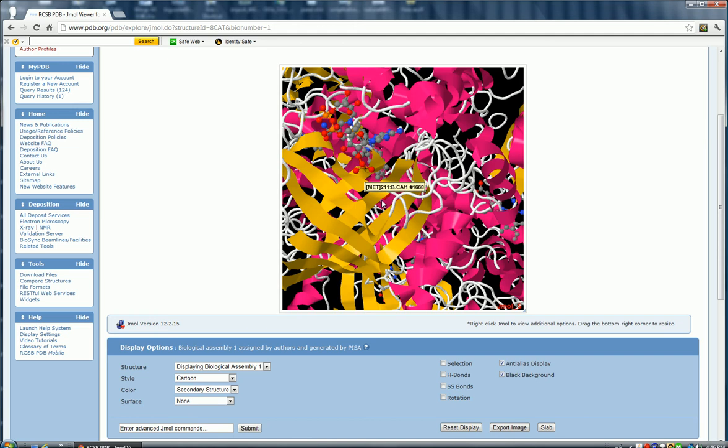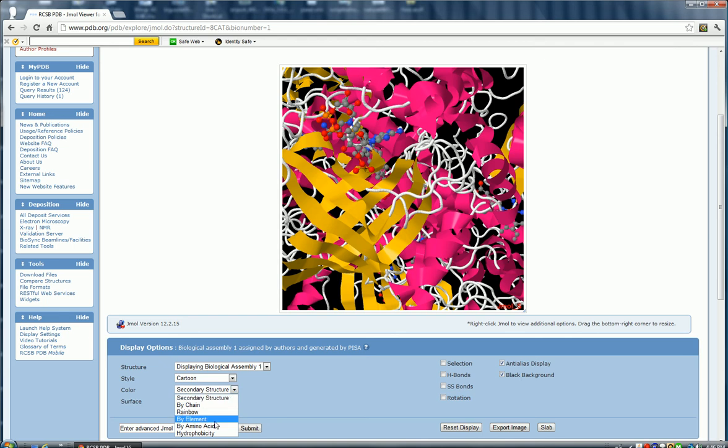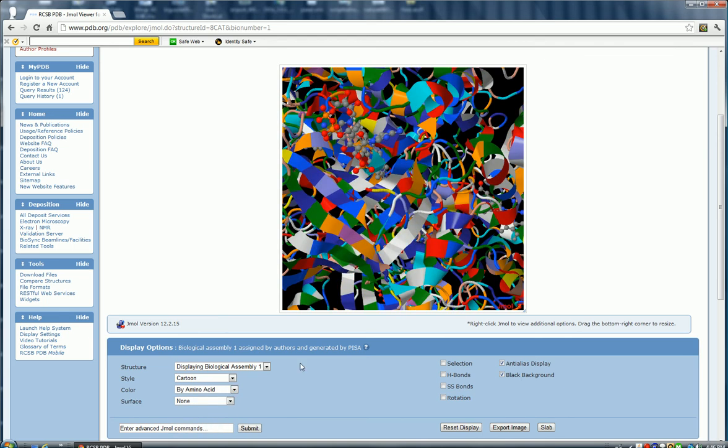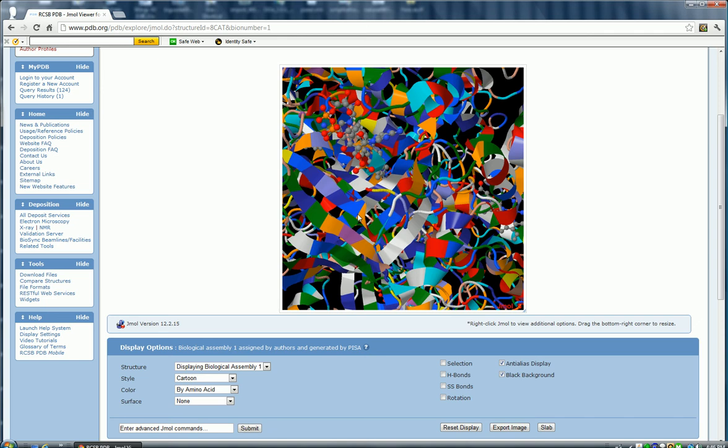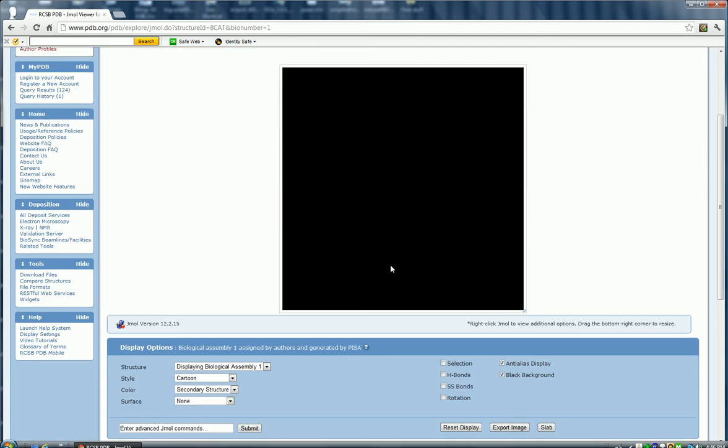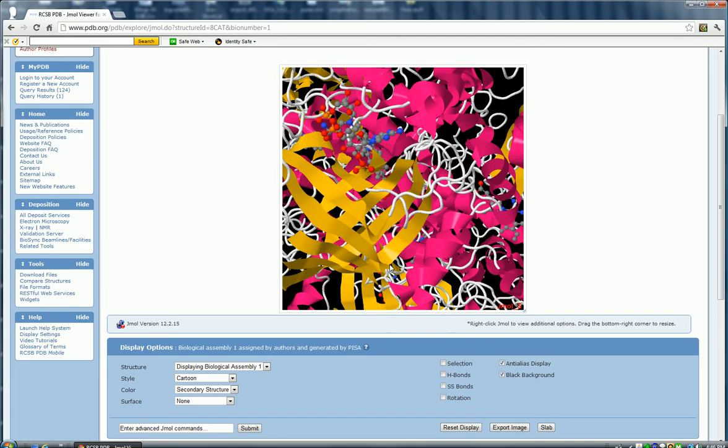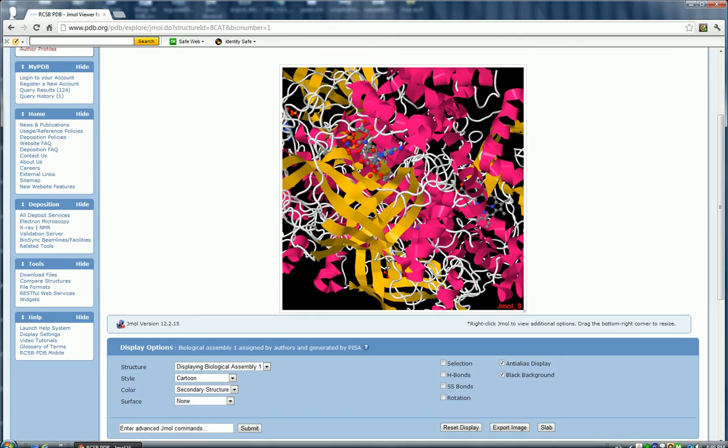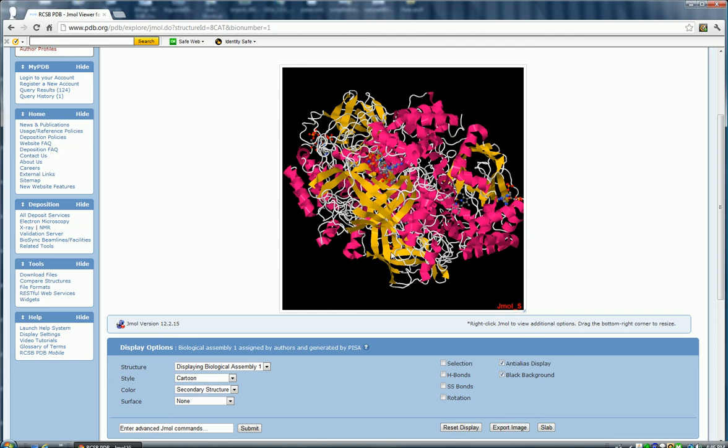In other words, what's happened here is that the primary structure, and I can switch to that just for a second, the primary structure has just folded to give these complicated sheets and helices, depending on how the amino acids interact with each other. So there's my secondary structure again.